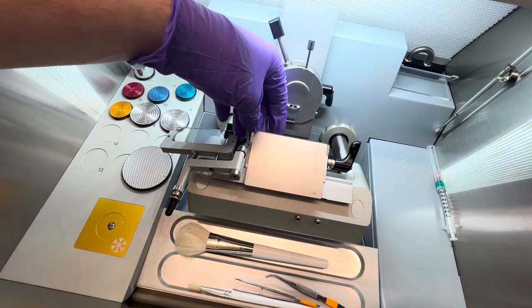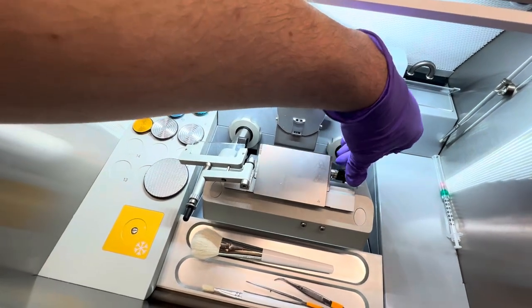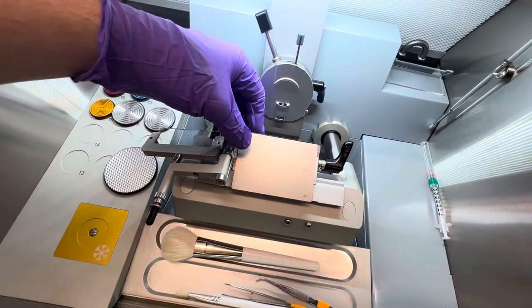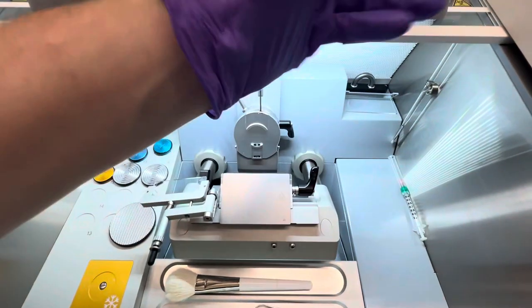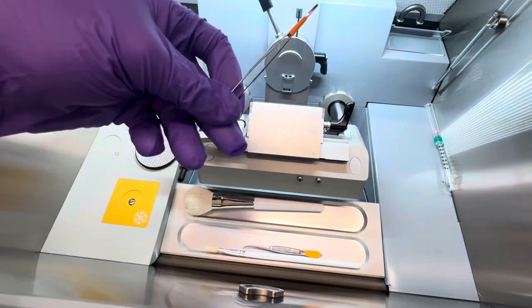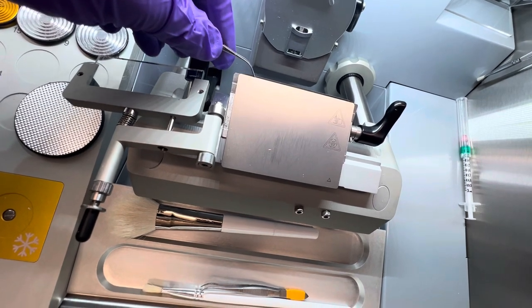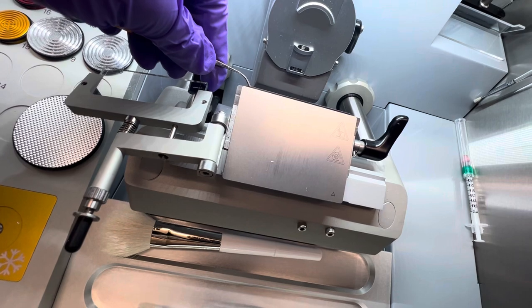I kind of push it from the side a bit if it's not centered, and then you'll be able to clamp it down. Nice and tight, you pull on it, and it shouldn't move. In this case, rather than trying to touch my fingers like that, these would usually all be on the toolbar, but somebody wanted to set them there. You don't have to test it like this, but I'm just going to show you that.